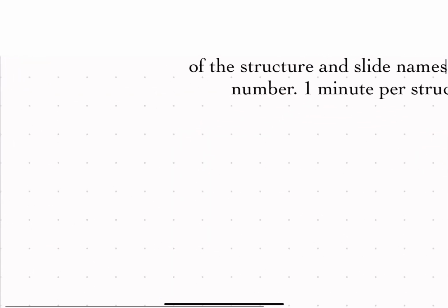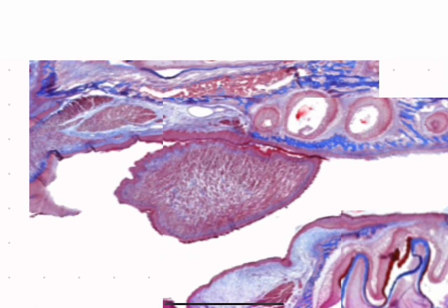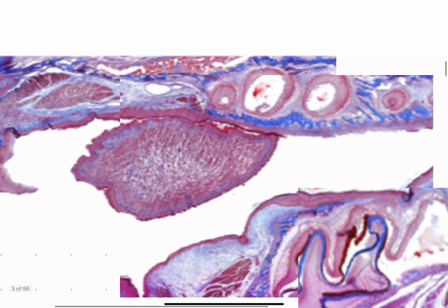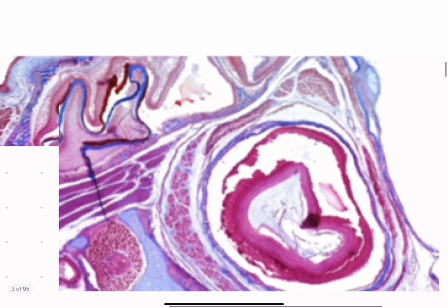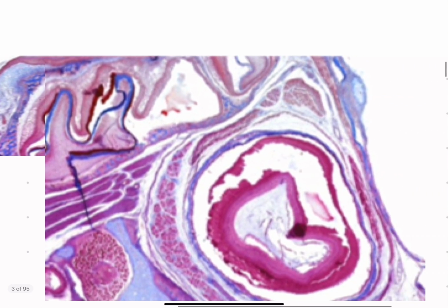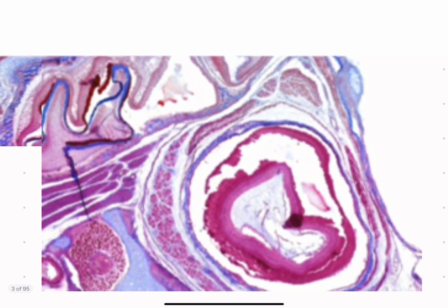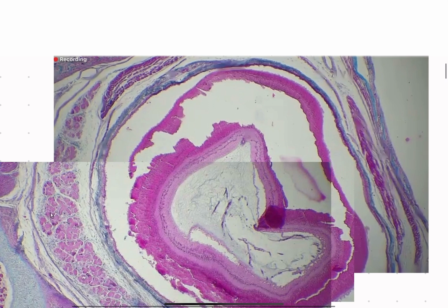Okay, the timer has started for the very first test. Now this would be the first slide we're seeing. And then going towards the bottom right area, we see this. So this is all within one and the same slide. I'd like you guys to tell me once we zoom in, like so, what the name of this structure is called. So both the slide name as well as the structure name, please.